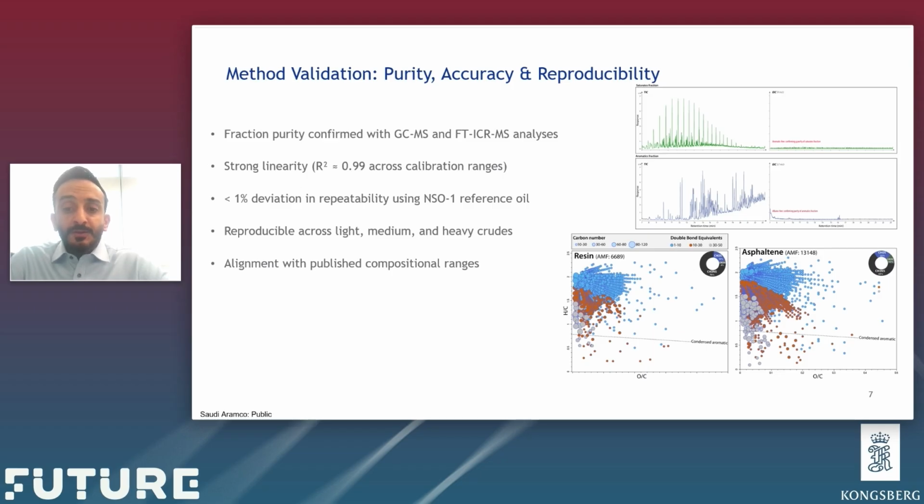The calibration curves showed excellent linearity, with R square values reaching 0.99 across the different concentration ranges. For reproducibility, we used a reference Norwegian crude oil, abbreviated as NSO1.